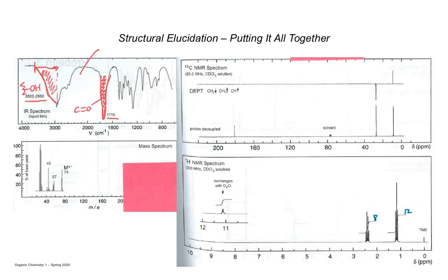So overall, from the IR, we can piece together this fragment, a carboxylic acid. And that's equivalent to CHO2. So we're slowly building up a molecular formula. The other thing we can point out is that the carbonyl group is 1 degree of unsaturation.